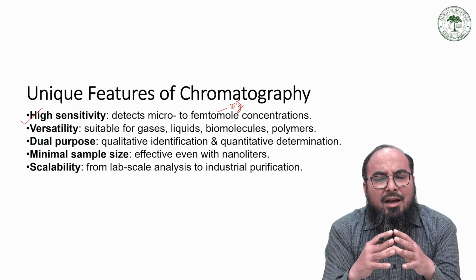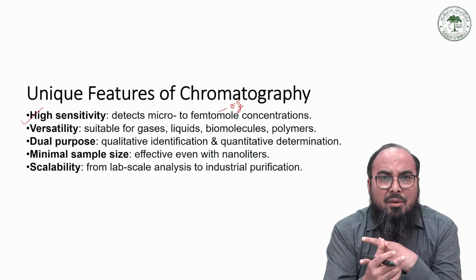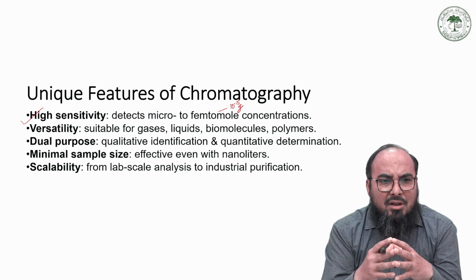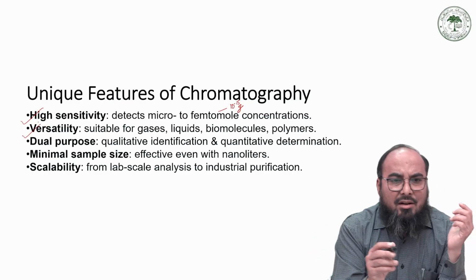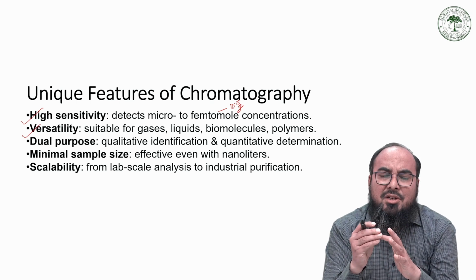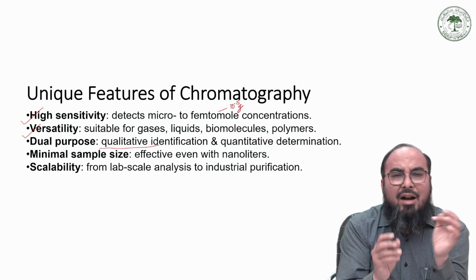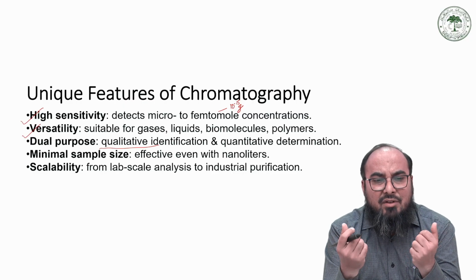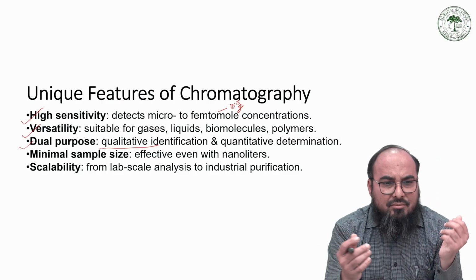You can identify gases, solids, liquids, polymer material, biomolecules. Just name the compound and the answer is chromatography. So versatility is there. As I have already discussed, it is a technique which can give you identification, a qualitative idea, as well as the quantification of different constituents present in a given sample. So it serves all the purpose of separation.